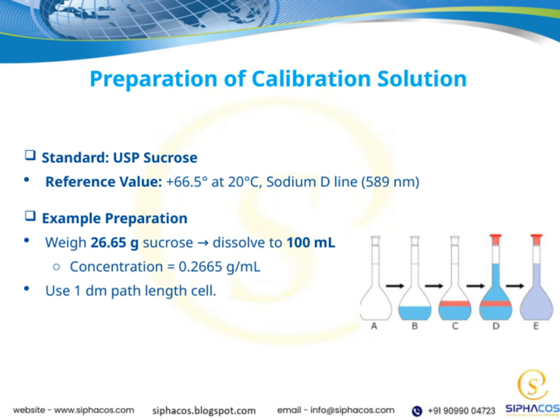spectroscopic calibration. It's important to get this preparation right because it forms the basis of our calibration curve, ensuring that our subsequent measurements are precise and reliable. By understanding and carefully preparing this solution, we set a solid foundation for accurate temperature and spectral analysis.